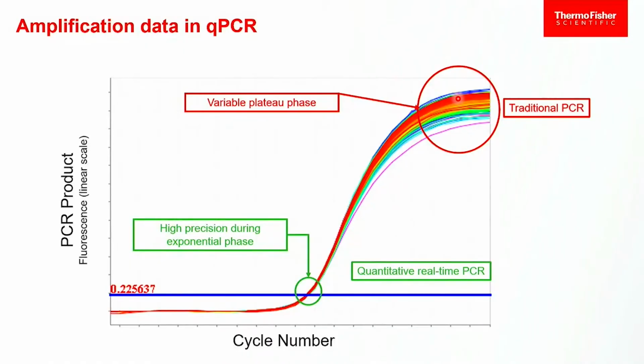Just to highlight here, plateau phase doesn't have anything to do with your sample. It has to do with your reaction components, independent of sample. So just because you see a difference in your plateau phase doesn't necessarily mean that you have a difference in quantity of your sample.